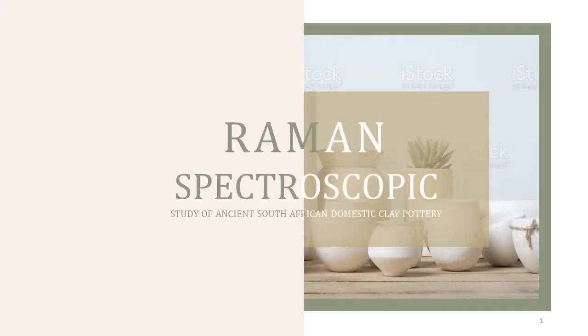Greetings everyone. Today we are about to review the topic Raman spectroscopy, a study of ancient South African domestic clay pottery.